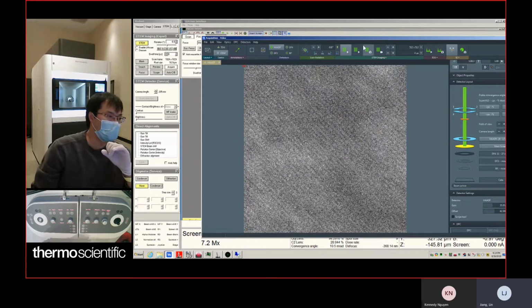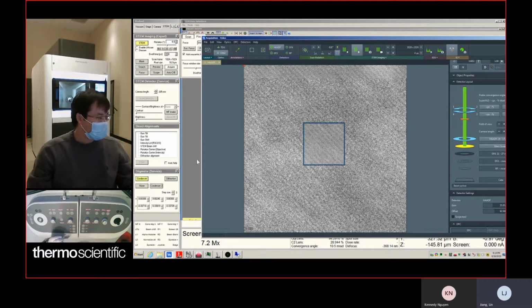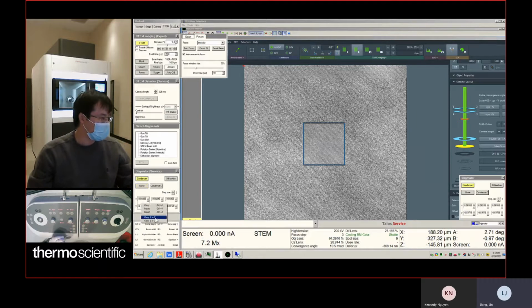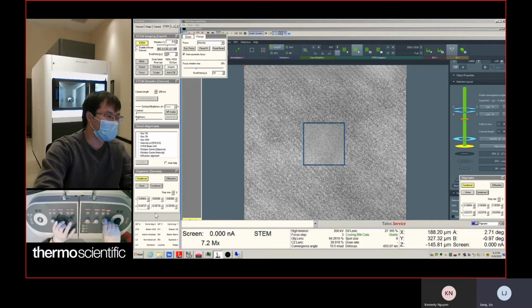Somewhere around here. We might need to adjust the astigmatism. Bring it back.